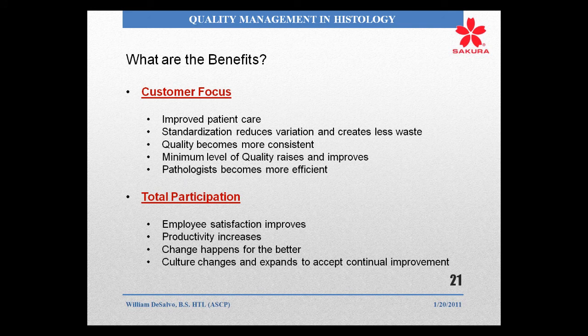So what are the benefits? And again, this is a general overview. This is trying to get you to understand and be thinking about how to set up a quality management system in histology. It is very involved, but there are a lot of benefits that you will realize.